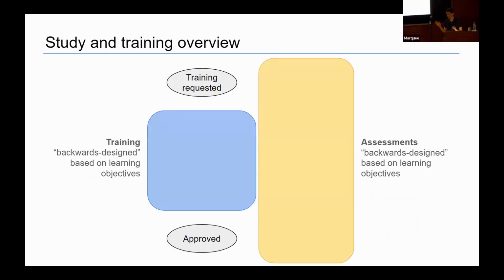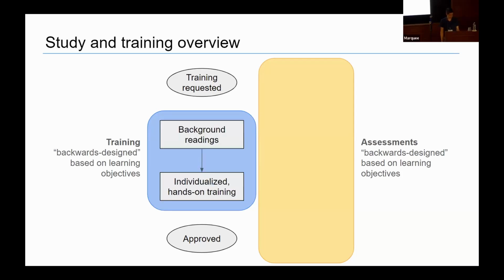All right, I don't have time also to explain the actual training program. Suffice to say, what Sylvie was describing earlier is what we used to design what we were doing. We started out by making learning objectives, which are the things that Sylvie was talking about earlier, those learning goals, and then used that to develop our training and our assessments. And that's called backwards design, in case you're interested. Again, I can provide more information about that later if you want, or even better, you can attend Sylvie and Rhonda's workshop where you can learn a whole lot.